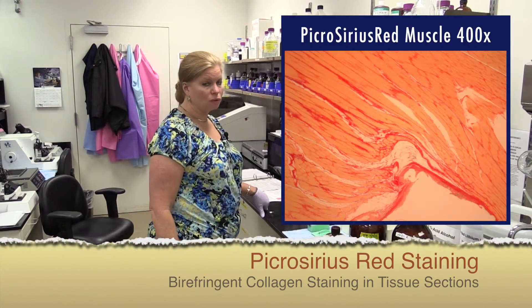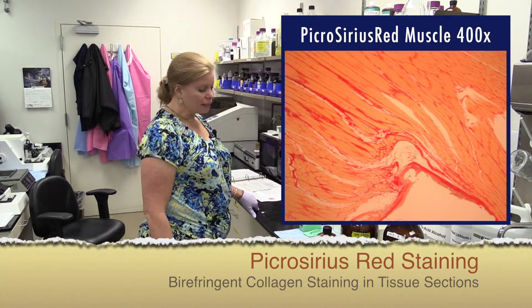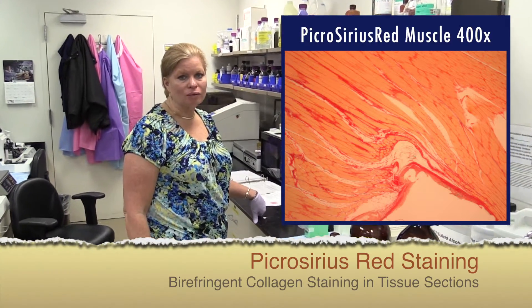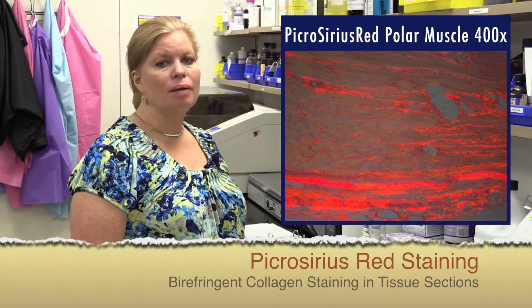I'm going to be demonstrating the Picrosirius Red Stain. The Picrosirius Red is not always on the radar of researchers and pathologists, but it's a really great complement to the Masson's trichrome stain.